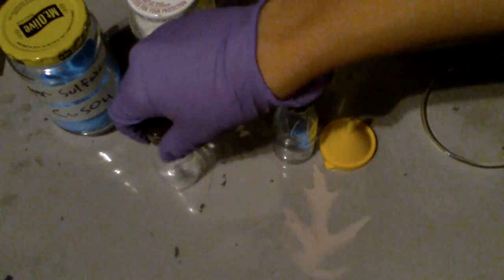The first thing you're going to do is measure out some copper sulfate. I just put a small amount in this jar. And I also put a small amount of boric acid in this jar.